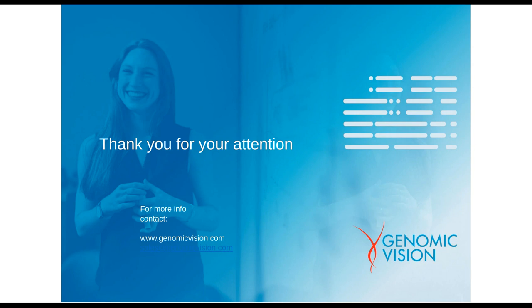I would like to thank you all for the attention to the presentation and the kind questions. I would like to remind you that the replication combing assay is a very robust and precise method that can be used for drug screening, and in certain instances also to refine the treatment for patients. And with this, I give you my best wishes, and thank you again.